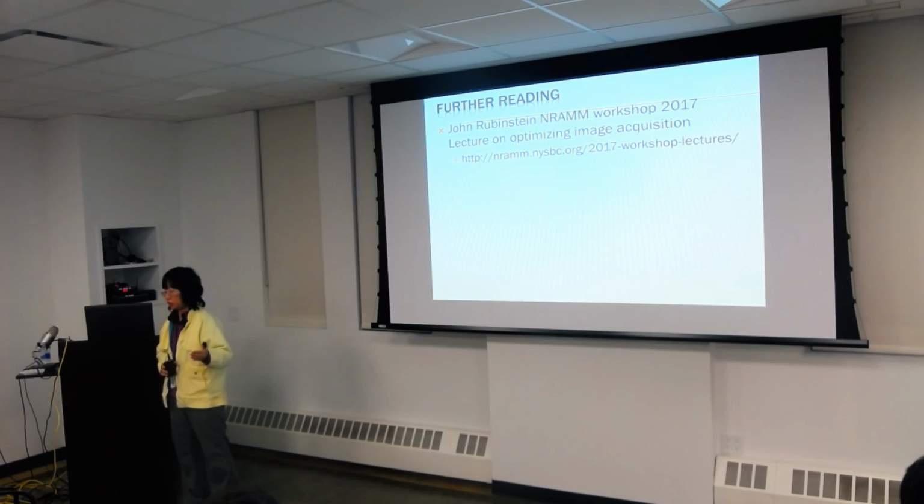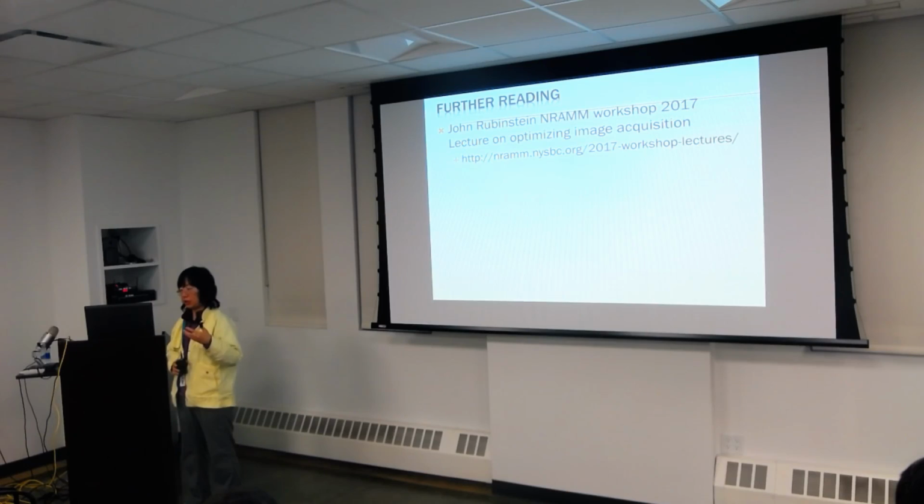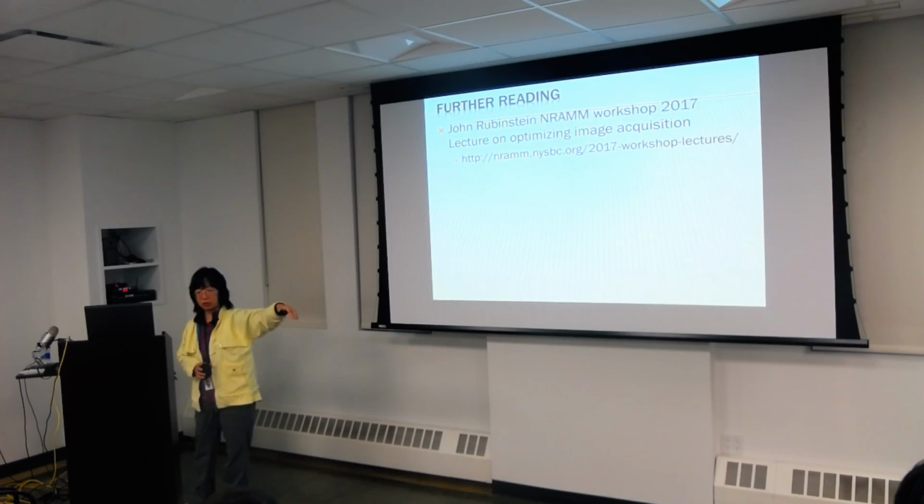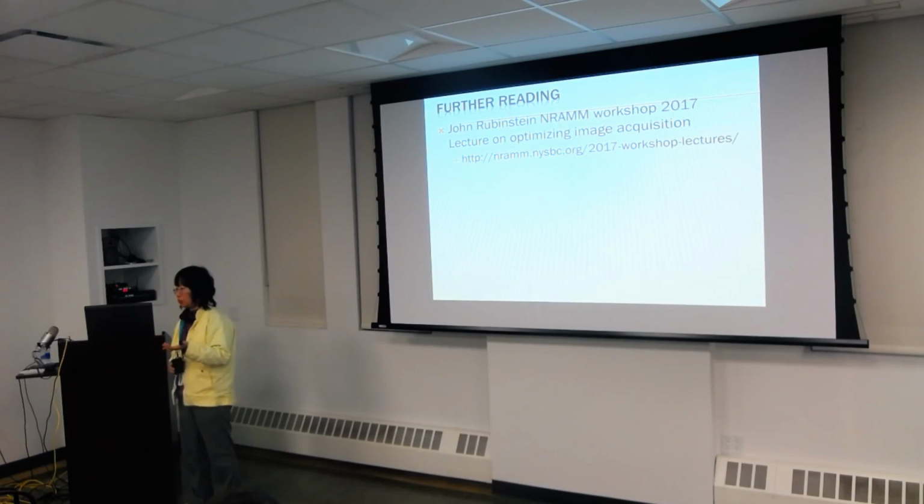The reason you can do that has a lot to do with using a low defocus. When you are using a phase plate, people generally use about 0.5 micron defocus. At that defocus, your envelope function dampens slower, so you can get your high resolution information without worrying about it being damped by your microscope envelope. That's why it's preferred. The minus, the con of the phase plate, is that we do not understand how it works very well, and it's not as easy to use. People can take defocus images very easily, but to get phase plate images properly, not everybody is doing that.